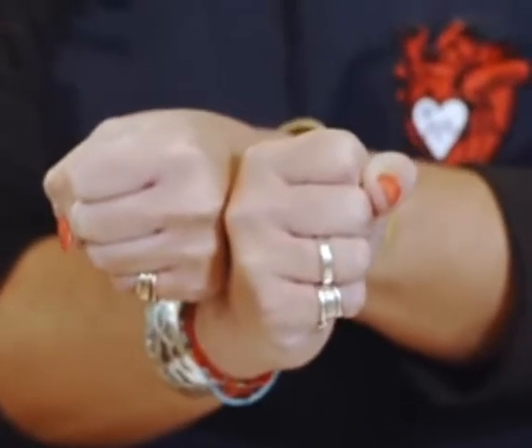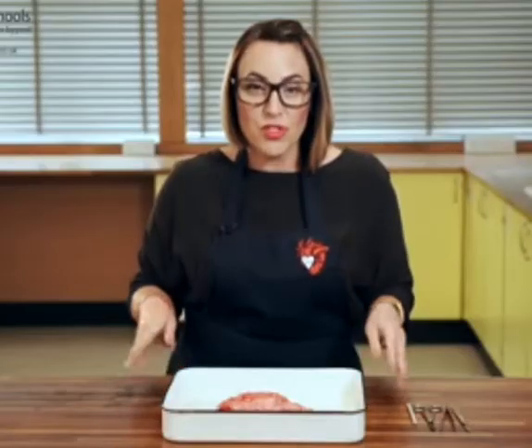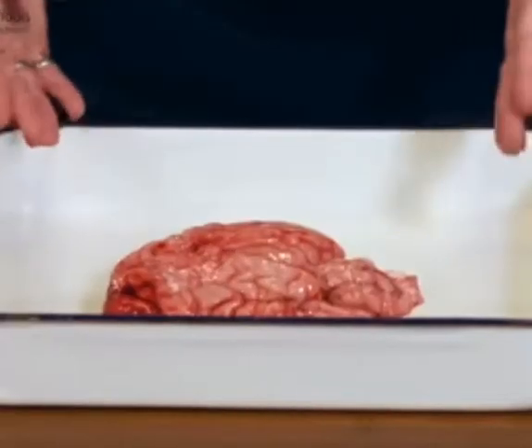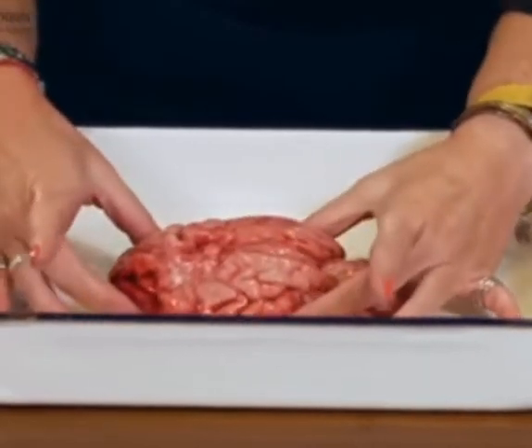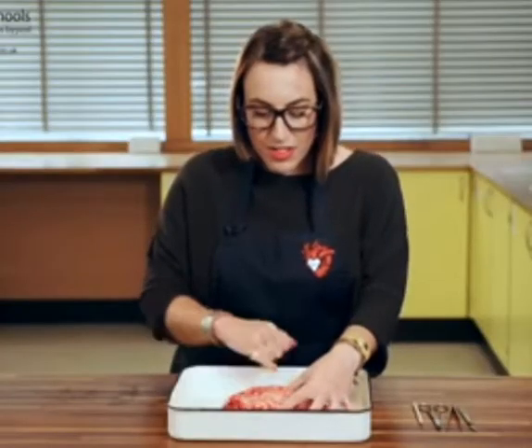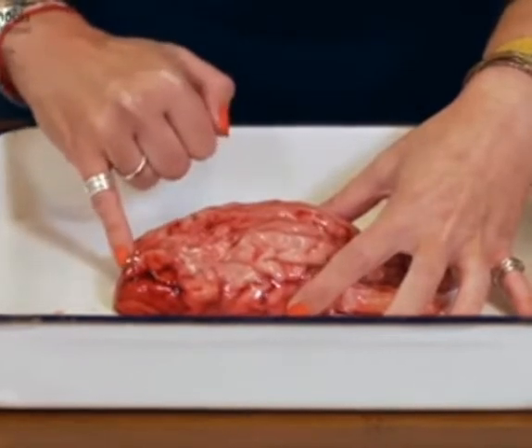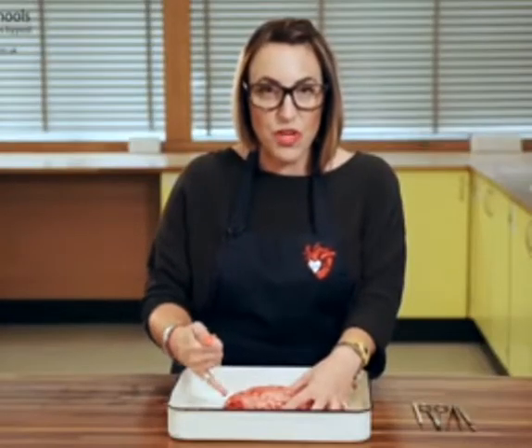Between the corpus callosum. When you receive your sample, you'll be able to see the cerebral cortex covering the whole surface of the brain. You'll be able to identify both hemispheres of the brain. You'll be able to notice a central portion running down the middle, which we call the longitudinal fissure. This is the gap between the two hemispheres.